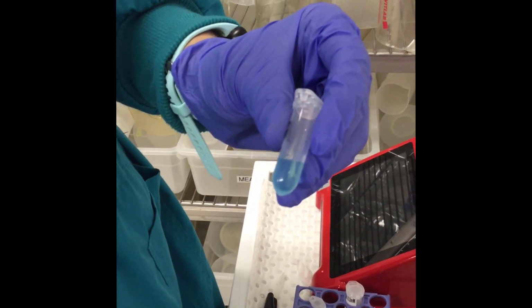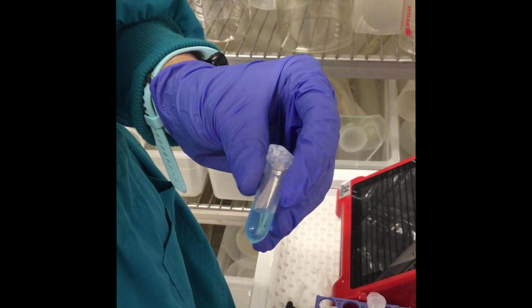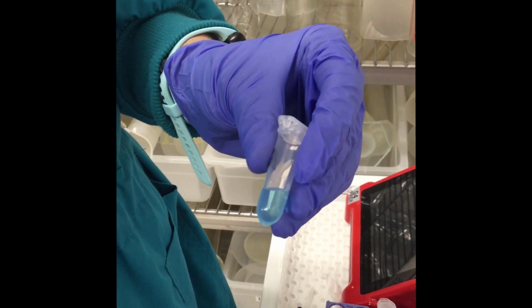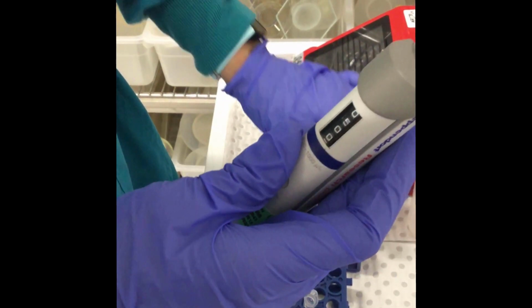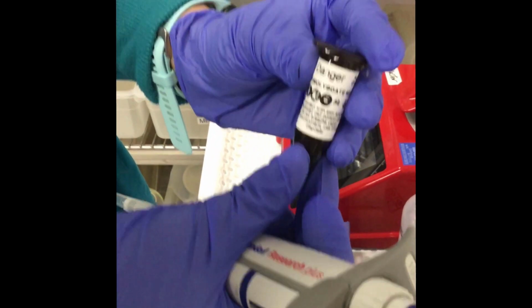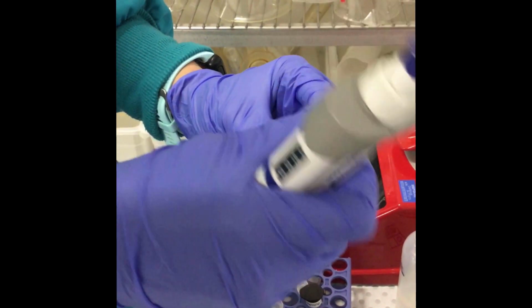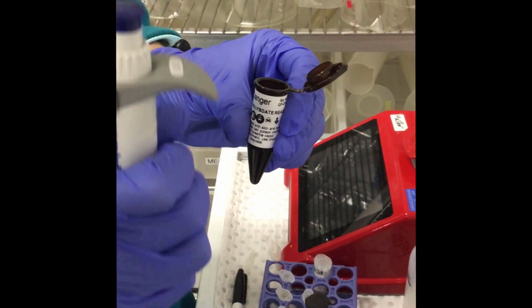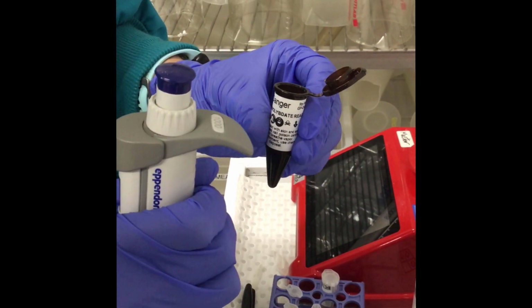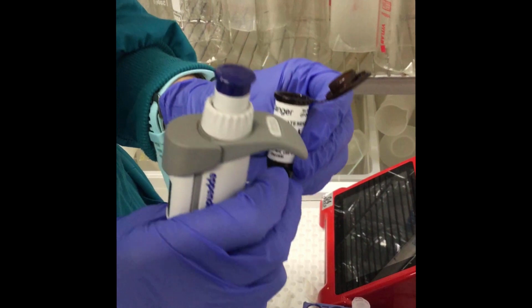After your samples have come out of the heating block, they need to cool. We will provide you with ice for this step. After they've cooled down to room temperature, we're going to add 0.5 mls of our arsenomolybdate reagent. Again, the arsenomolybdate is toxic to the aquatic environment, so this needs to go also in the waste containers that are provided, or back in the Eppendorf tubes that should be sealed before they're tossed into clinical waste.